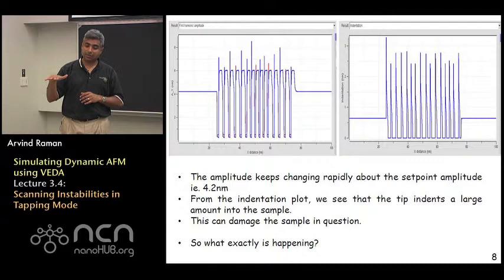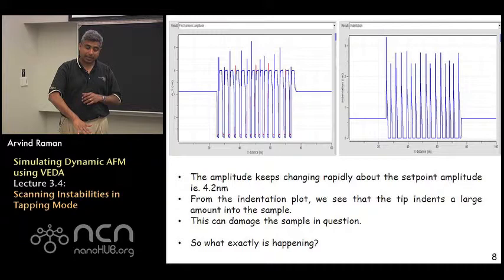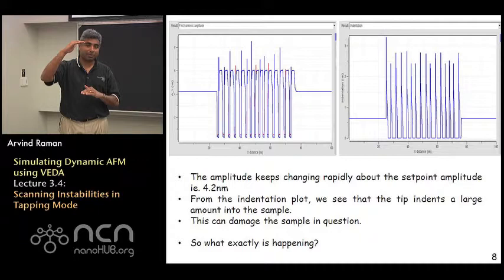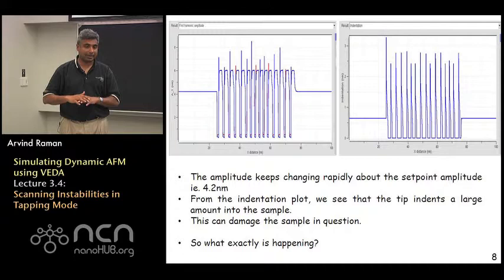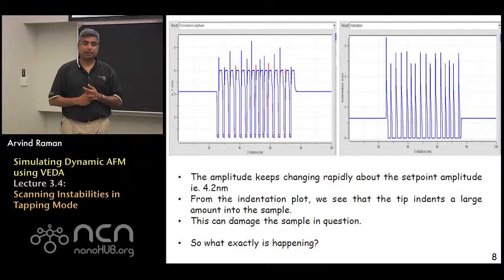What we find is that while the amplitude is nice and constant on the substrate, as soon as one hits the feature, the amplitude suddenly plunges, and then the z controller tries to move things and get the controller amplitude back up to the desired value at the 70% set point. It is not able to, and the amplitude goes back down again rapidly, and this keeps repeating itself.